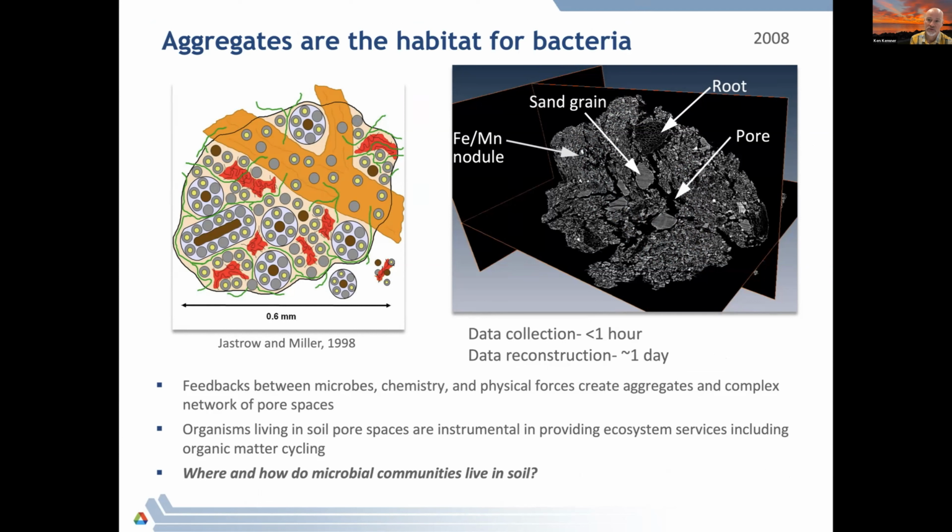And now you can imagine what was exciting back then was that on the same day you collected a soil tomography data set, you could actually view it and determine if new data had to be collected on that. So this idea of feedback was something that was becoming important even back in 2008. So advancing this one slide, you'll see that I now have these little Pac-Man cartoons that I drew in here.